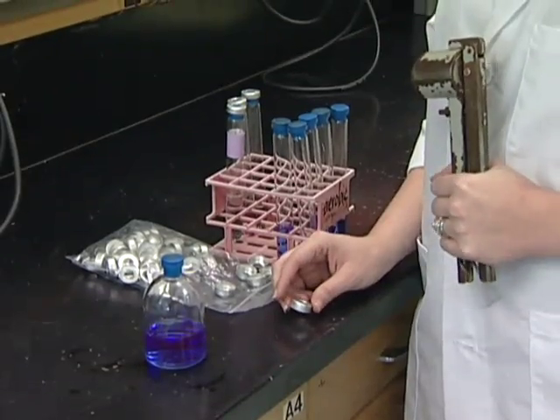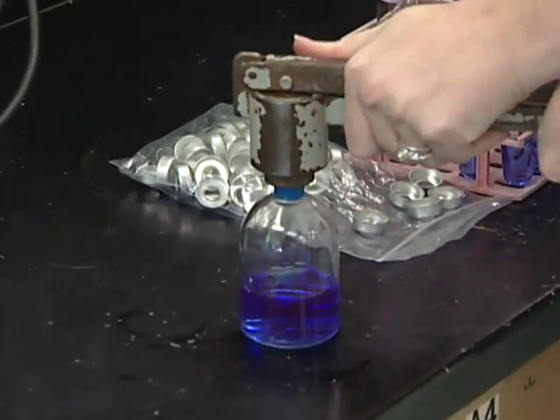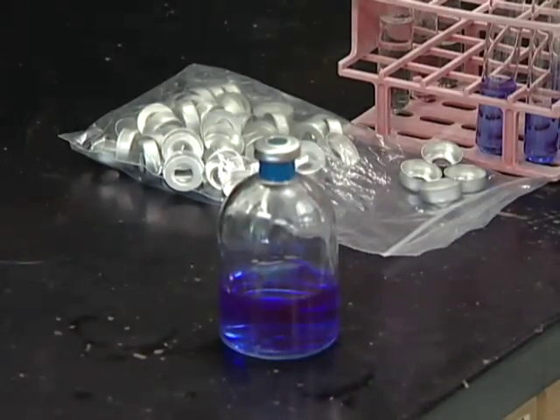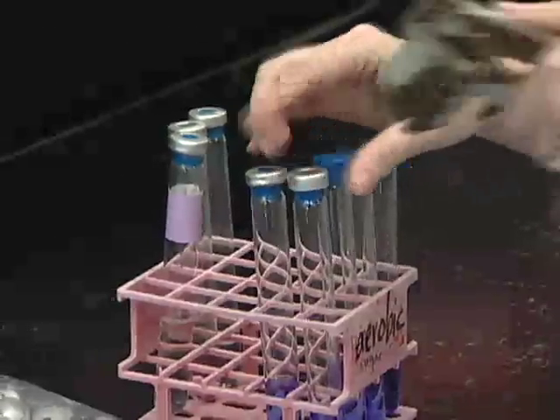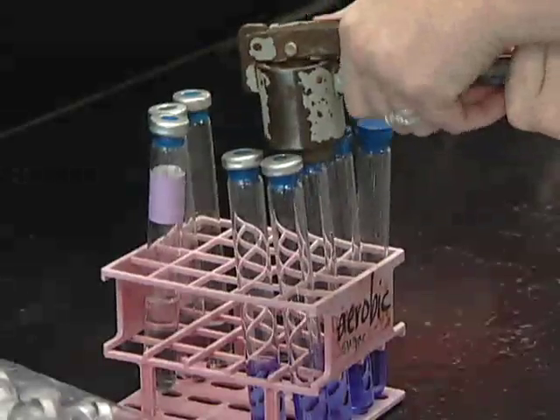Now that you've got your media dispensed, we'll want to seal it with aluminum seals. We do this for two reasons: one, so that the stopper doesn't pop out while you're autoclaving, and secondly, because some of these cultures will later on be under pressure, and your stopper will pop out again. You want to make sure you get a good, even seal, and that it is actually crimped all the way down.